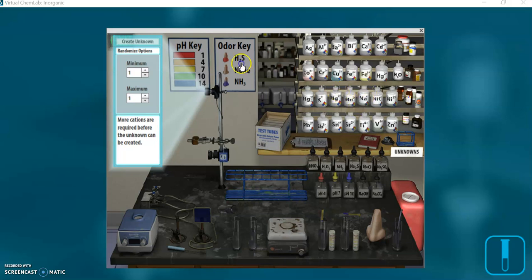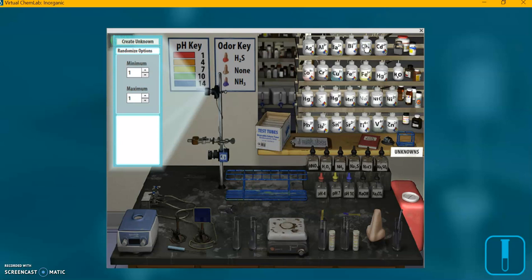There's sodium. What else does it say to click on? Potassium, calcium, barium, strontium, and copper.